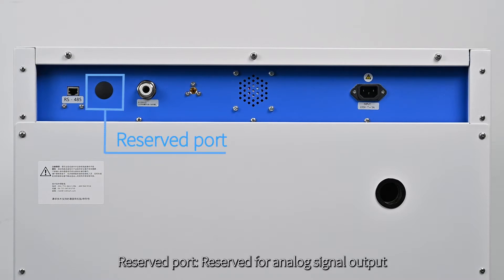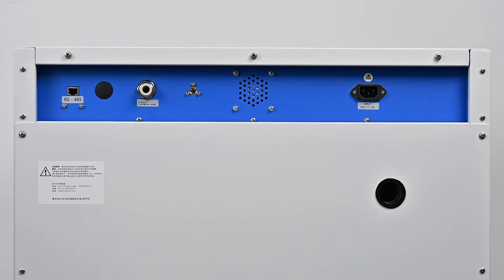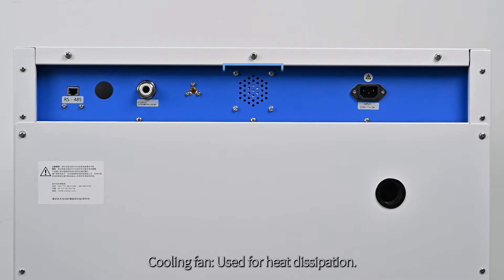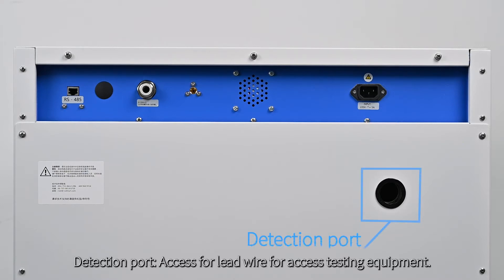Carbon dioxide inlet: used for carbon dioxide gas source intake. Carbon dioxide detection port: used for carbon dioxide sampling within the incubator. Cooling fan: used for heat dissipation. Power socket: for connecting to the power cord. Detection port: access for lead wire for testing equipment.